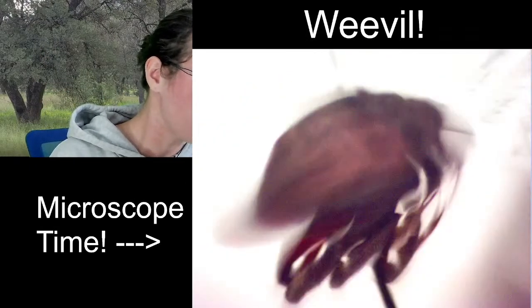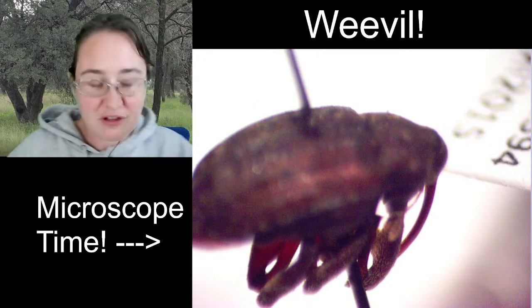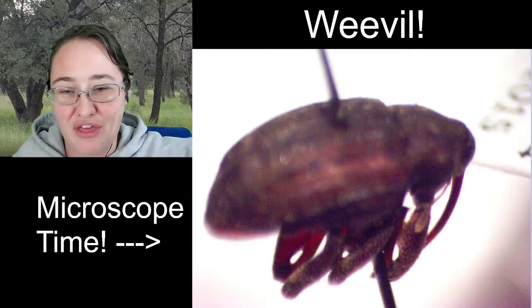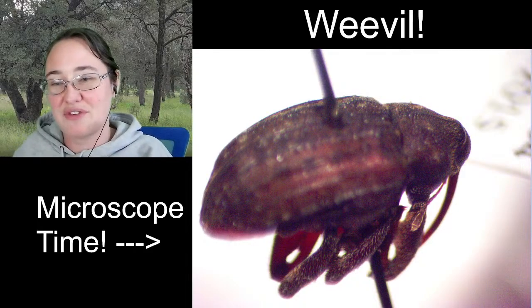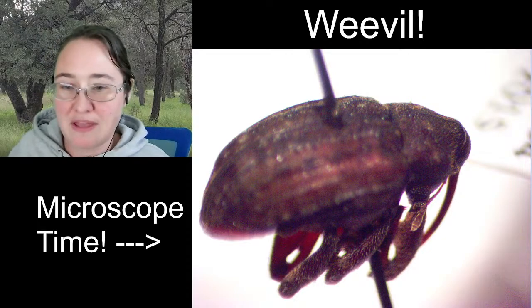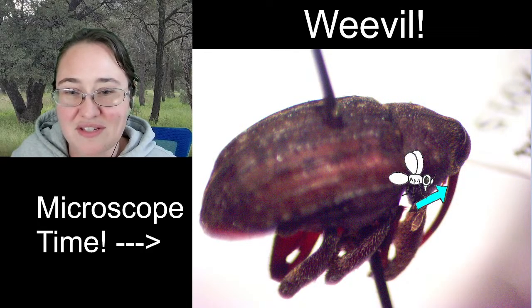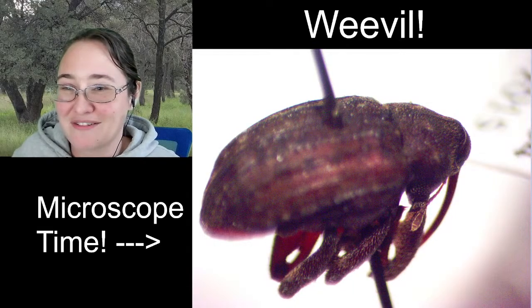And the third option, I believe, is some type of acorn or nut weevil, because he's got that really long, thin snout that I know a lot of people think of when they think of weevils. When they hold their snouts at rest, they tuck them under their body, like under this way. So when I pin them, I don't pull their snout all the way forward. So we can see here, this right here is the snout, and it goes all the way down to right about here. It's impressive.